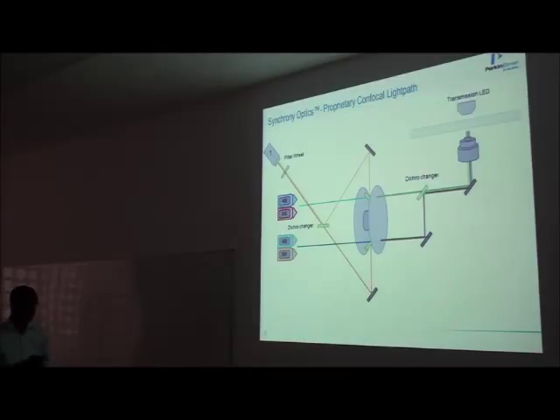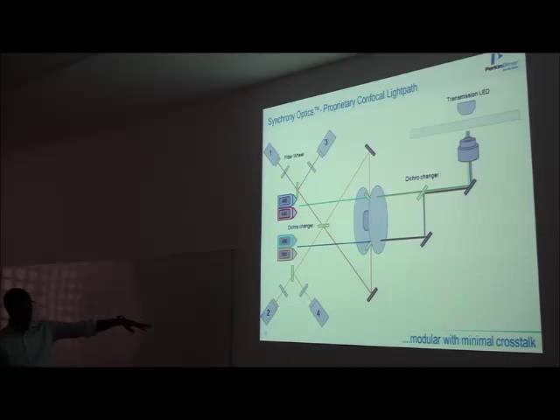But you see here, we have four lasers, for instance, 405, 488, 561, 640. And they are grouped 2x2: 405 with 561, and 488 with 640. But it becomes interesting when you have two cameras, because the 405 will go through pinholes which are not the same as the other, right? With two or with four cameras, you could put a splitter here to take the longer wavelengths, and then the shorter wavelengths will go to 1 and 3.